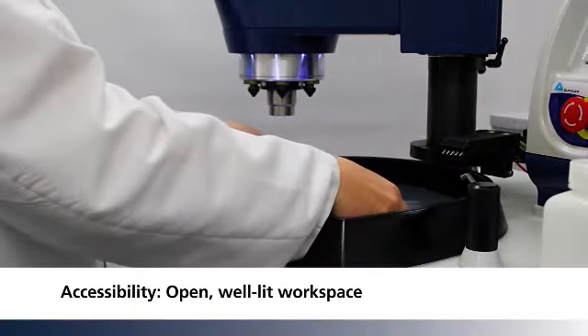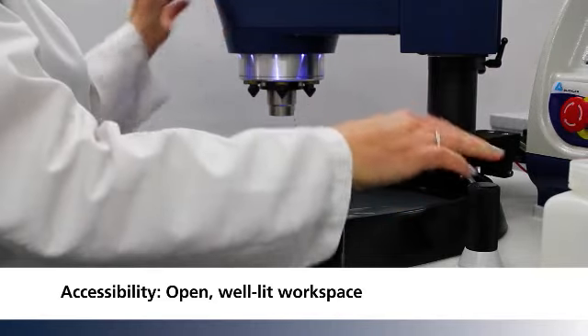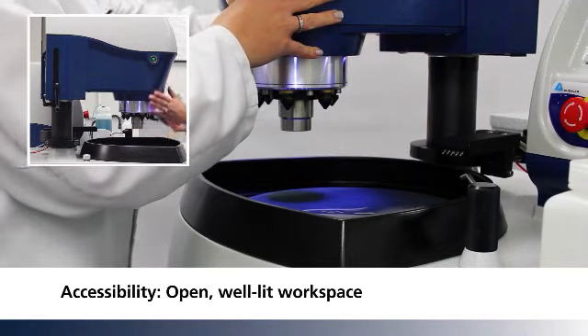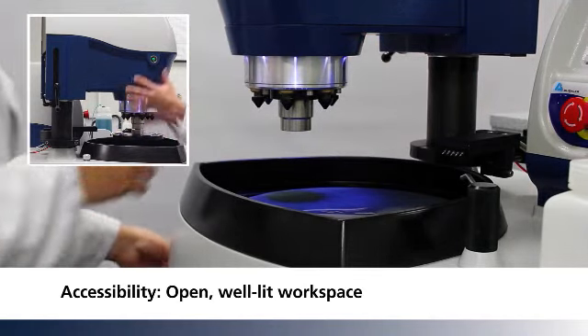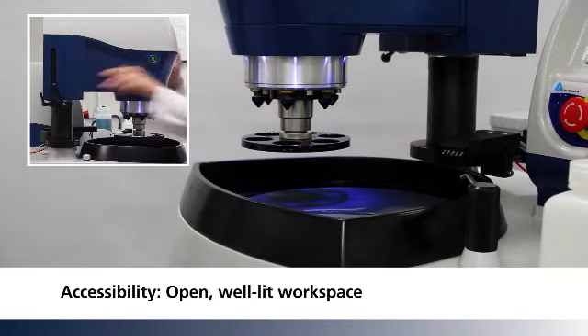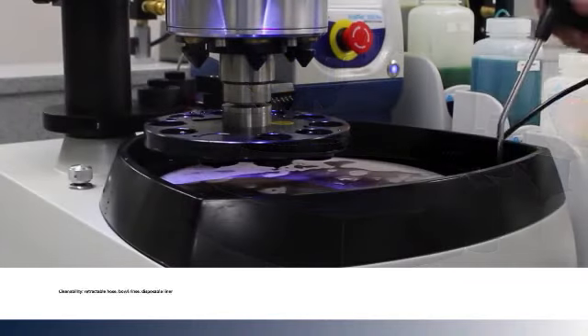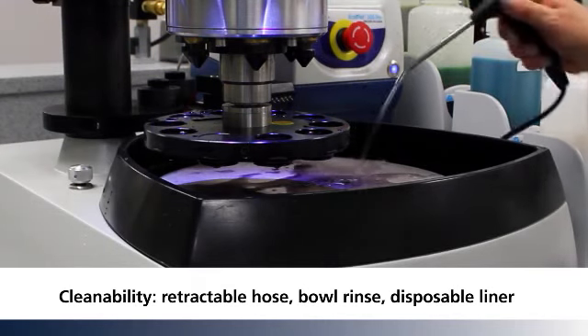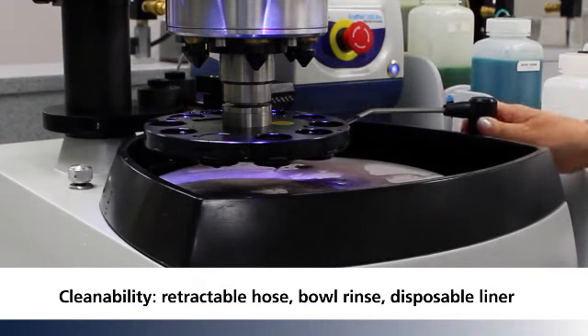With the open D-shaped workspace and LED lighting, specimen holder changes are easily accomplished. The well-lit space also makes it easy to adjust the holder location. Cleaning is simplified with a retractable water hose and integrated bowl rinse.